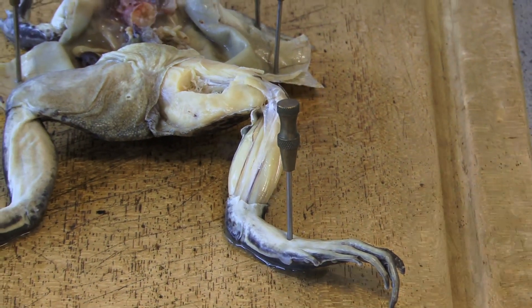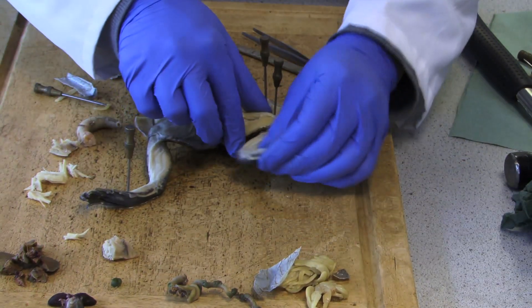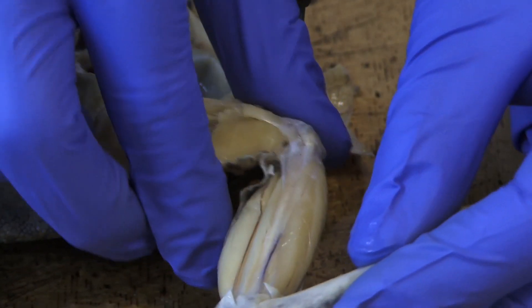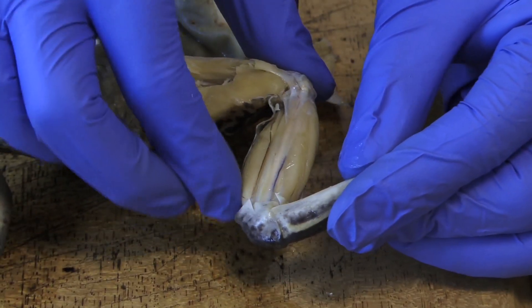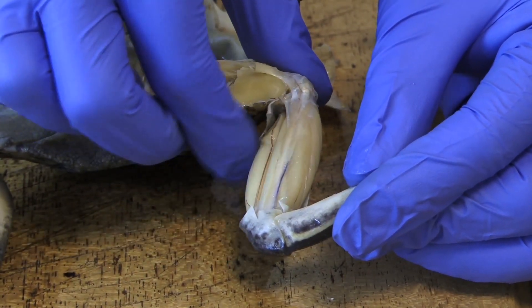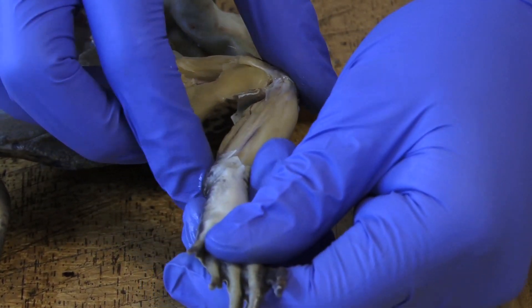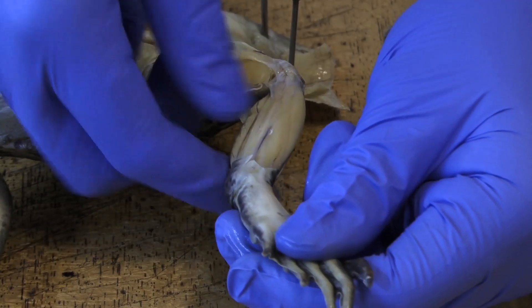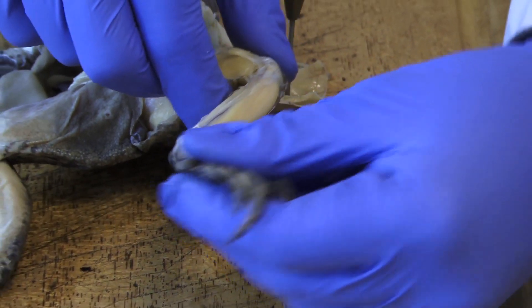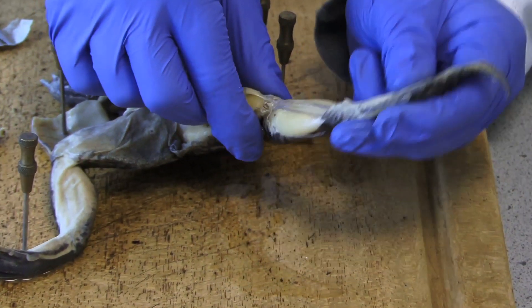So for example, if it was moving its foot upwards like this, then one thing you'll find is this one over here is relaxed and this one is contracted. But if it goes the opposite way, you can see now this one is contracted and this one has relaxed — it's gone more chunky at the back. And that is a similar mechanism to the way the human being's shin works as well.